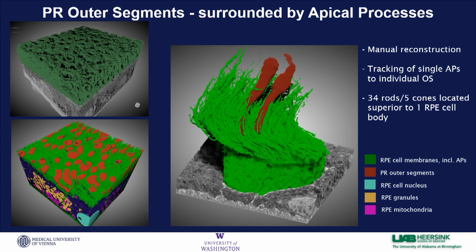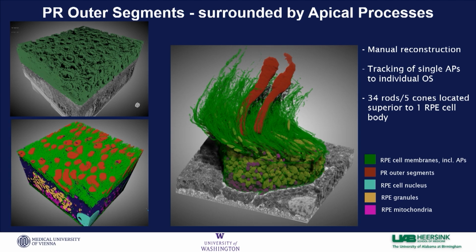And so this is just a quick look to show our segmentation, and then in the center, you have the actual organelles of the cell that we were able to quantify and do measurements with.